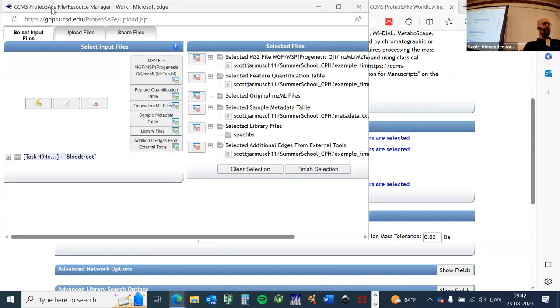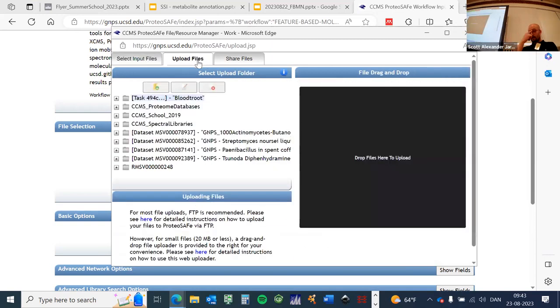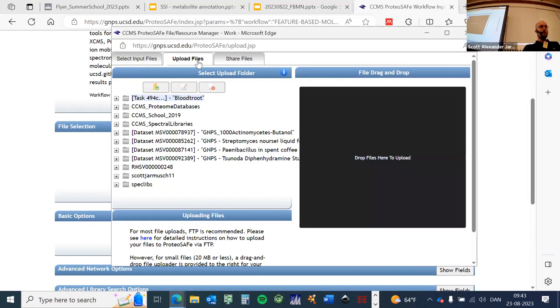Okay. So for those in the Zoom call, we have to upload our data first into any of this stuff. So into user. There are two ways to do this, through the FileZilla client or WinSCP. If you have really large files, that's the way you have to do it. But there is a web interface here where you can upload your files. So you want to find the folder that your data files are in. You'll have them located somewhere on your desktop.